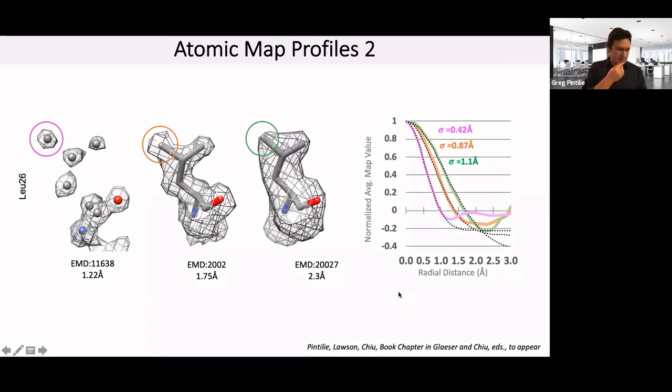So okay, as we were looking at this, I remember presenting this in a group meeting at one point, and basically I was suggesting that we can assess the resolvability of atoms in a map just by fitting Gaussians and calculating the sigma from the fitted Gaussian. And then you have a nice way to back calculate, you're fitting Gaussians, and trying to figure out what is the resolution of the map just from these curves.